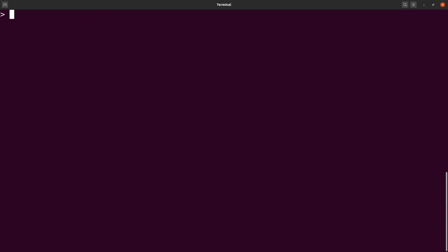One of the packages is available on GitHub, so we need to use another library to help us do the installation. So I'll load that library first. So I'll say library(devtools). Okay, so this library will help us to install one of the packages. So let's install the first package, which is hosted on GitHub. And so to install a package that is hosted on GitHub, we use devtools.